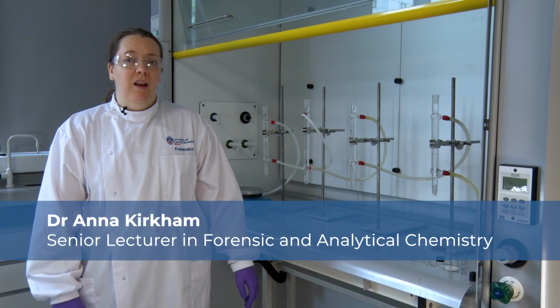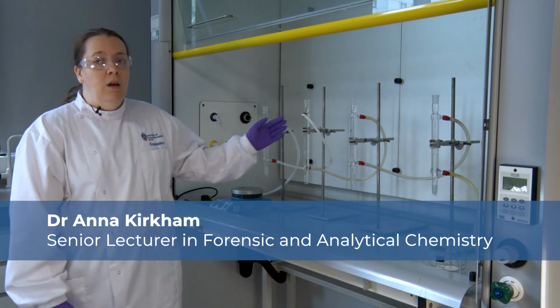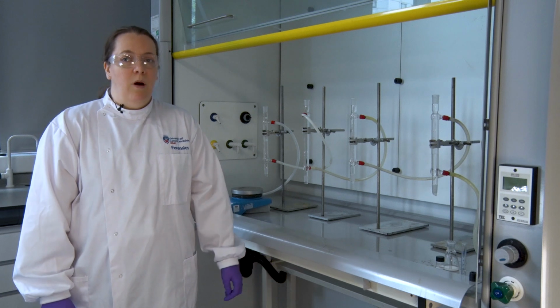Welcome to this tutorial. I'm going to show you how to set up the reflux and use it in daisy chain mode. I've got the sash higher up with the fume hood so that the camera can see what I'm doing.